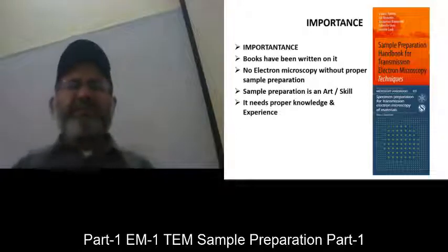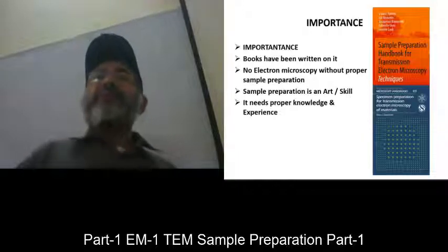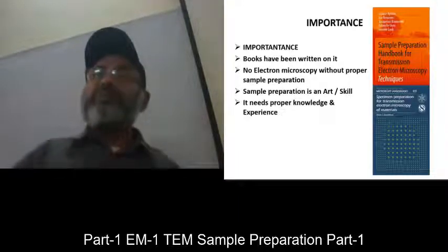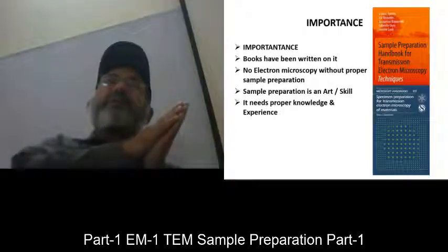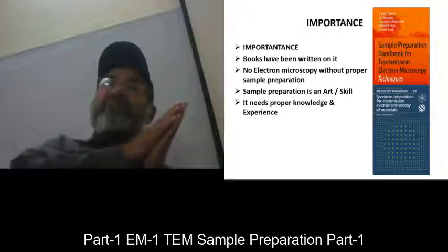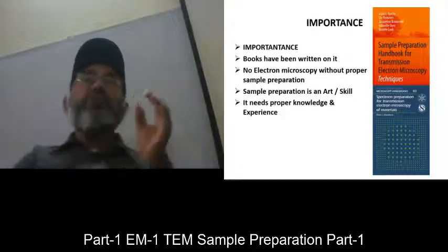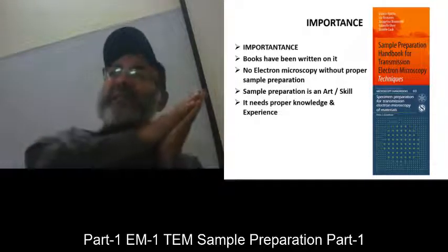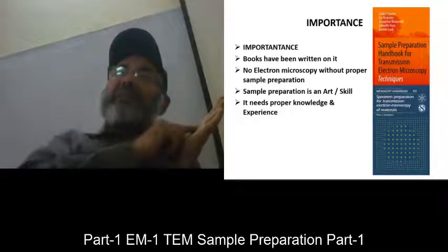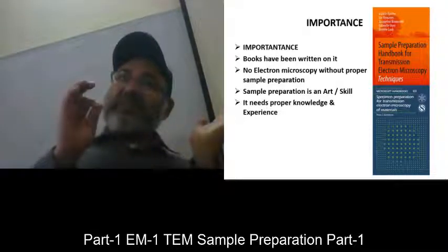The summary is that you cut a piece of sample from, say, a stone. You fix it with some gluing material which is meltable, right? Which can be melted, because when you are removing a thin sample from a hard base and it is not melting, then you lose the sample. But when it melts, then you get the fine sample from there.